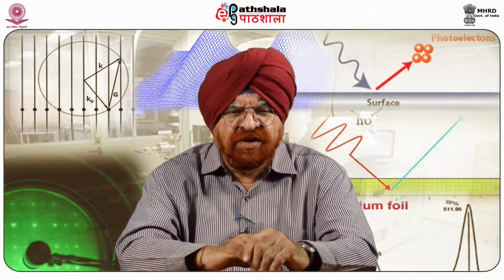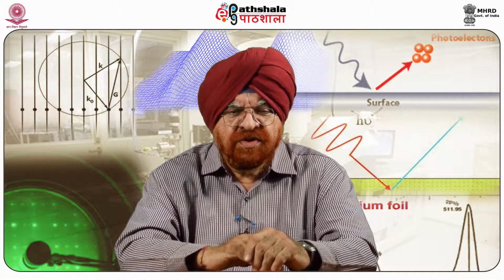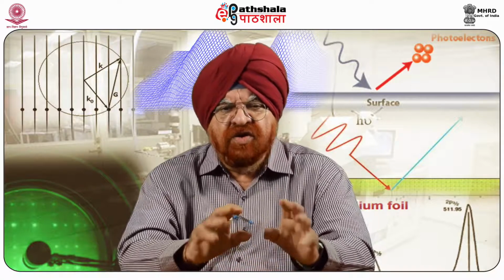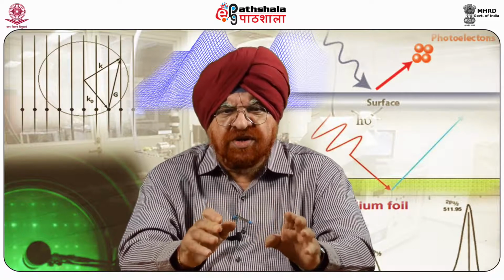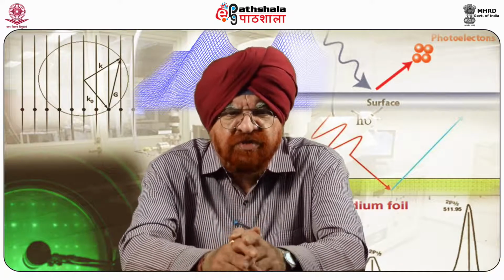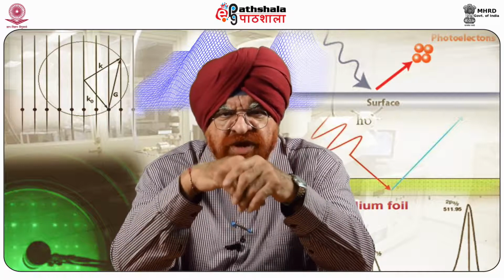Since the early 1990s, it has been widely used in the fundamental research of magnetic materials as well as in the development of magnetic recording components. This detects the quantity that is of particular interest for the magnetic recording processes, namely the magnetic stray field produced by a magnetized medium or by a write head.